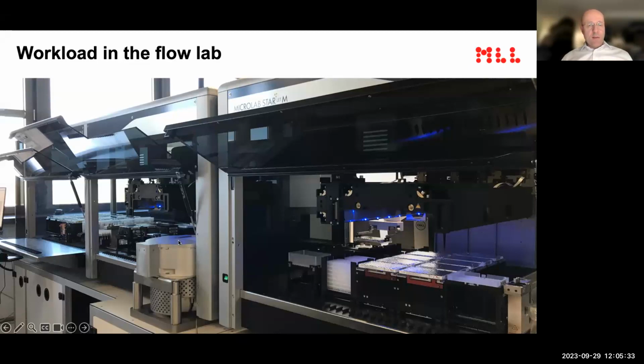What we get out is 48-well plates, which we can directly put into the flow cytometer for analysis. So we try to automate in the wet lab, and we can later do so in the dry lab.